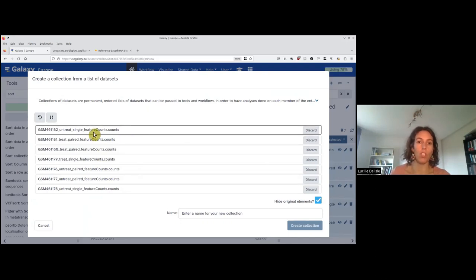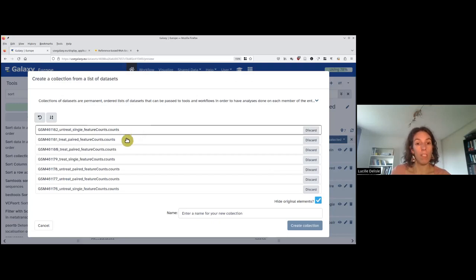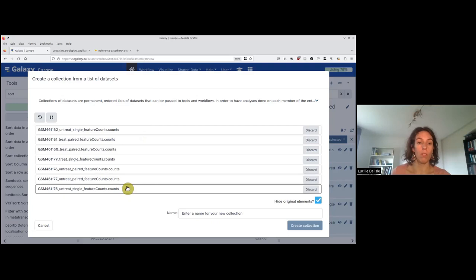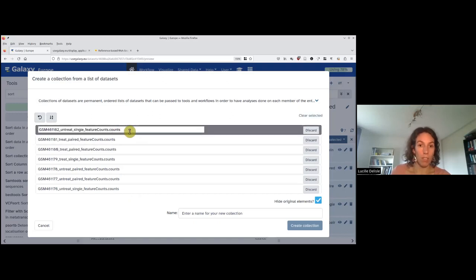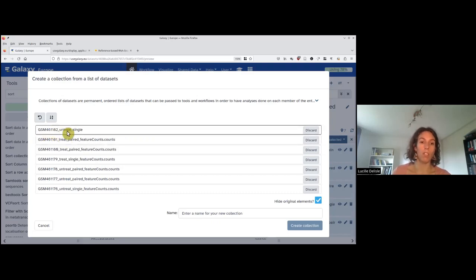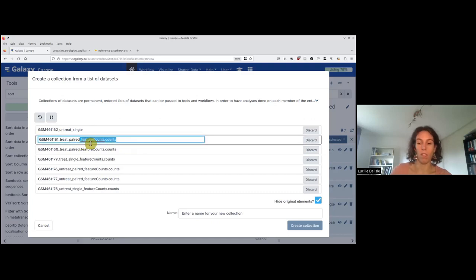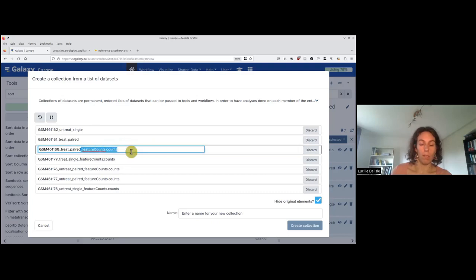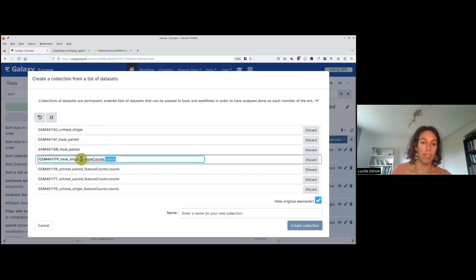I could have done the same analysis with the STAR counts, because the results are really similar. But just so we are all on the same page, we take the featureCounts counts. These labels will be used for all the plots and all the results, so it's important to re-label them the way we would like them to appear. I double-click, or simply click, and remove the 'featureCounts counts' prefix so I just have the name — the GSM ID, then the treatment, then paired-end or single-end. This is something you don't really like to do, but you need to do it.